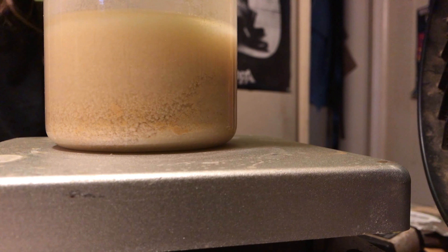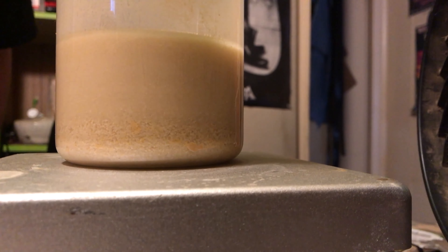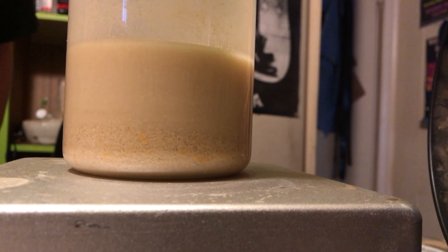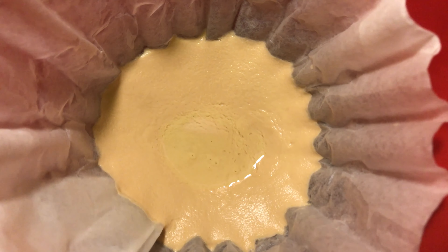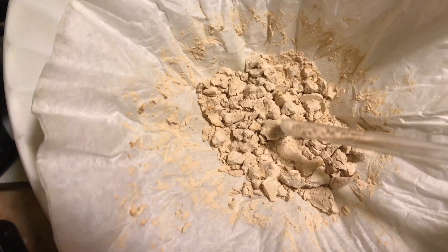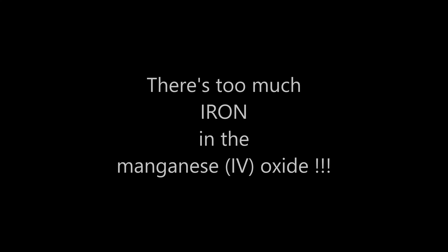Eventually this mechanical process turned out to not be all that efficient. I'm still getting yellow acetone at this point, but the result is looking a lot cleaner. I found out around this time that there was too much iron in the manganese oxide.